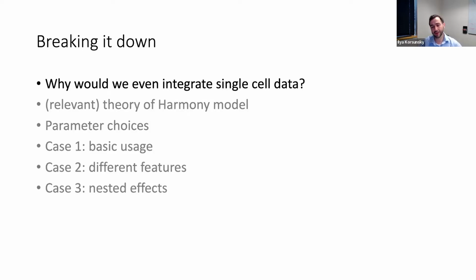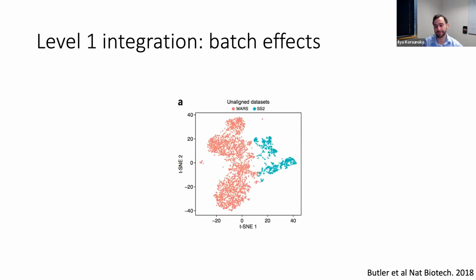Okay, so let's start here. Let's talk about this problem a little bit. What is single cell data integration? I would say that there's roughly 3 reasons that you would want to use this data set integration. One, as Sean already said, is batch effects, right? If I profiled basically the same system from very similar donors, but I did it with 2 different technologies, or on 2 different days, or with 2 different technicians, and when I plot all of my data into some low-dimensional plot here, the data completely separates by batch rather than by cell type, that's not great for my downstream analyses because I want the cells to cluster by cell type, not by batch variant. So clearly, this is a case where we would want to remove the effect of confounding batch.